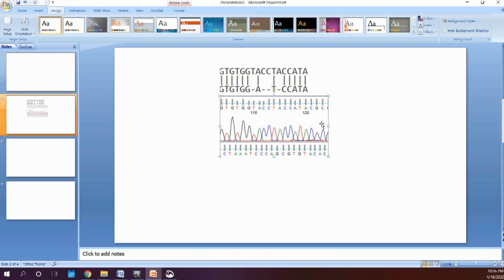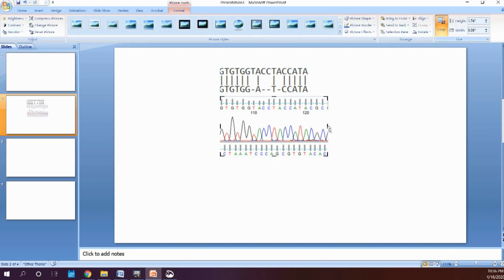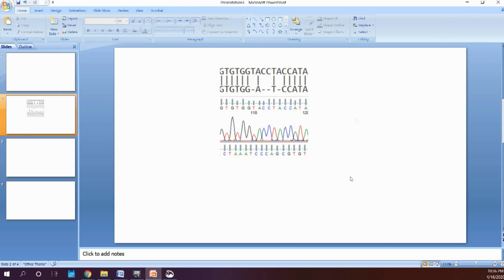There we go. So what you can do now is format this, you can crop it. And this is what you would show for your paper.